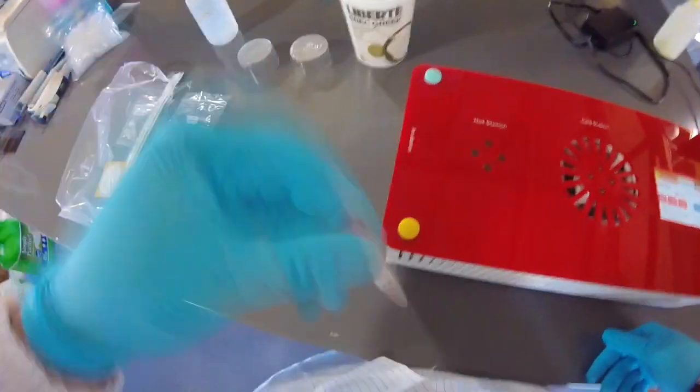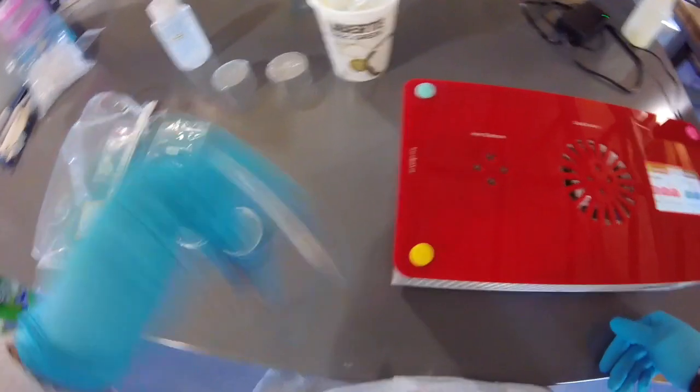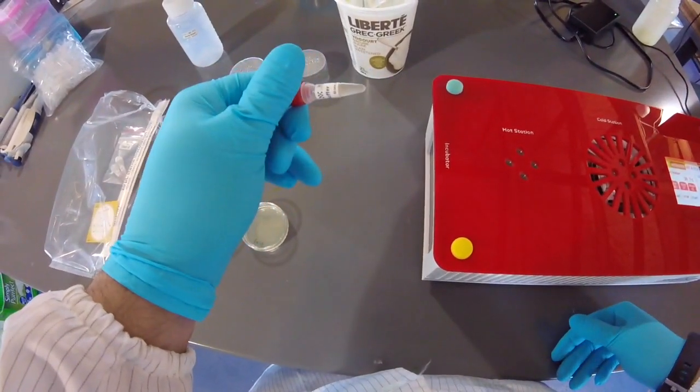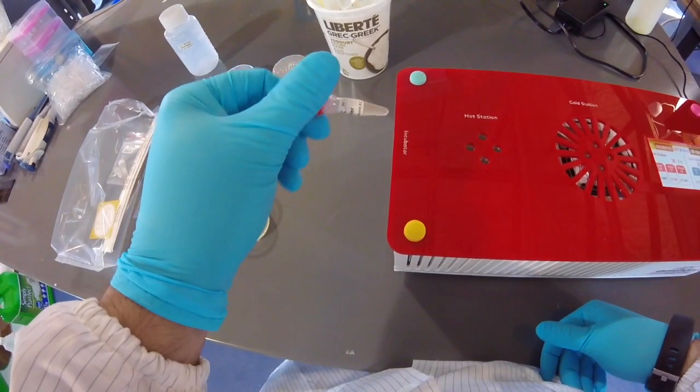So we have our cells. Some of the way through, it's always good to grab your cells, give them a shake. That will just make sure they're mixed and suspended and still kind of floating around, able to eat those nutrients and continue to grow and divide.